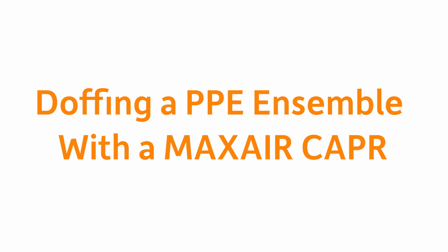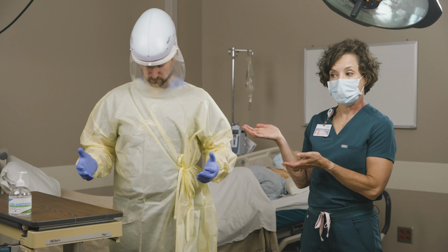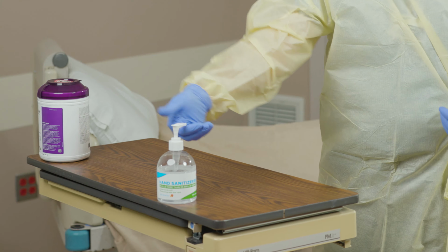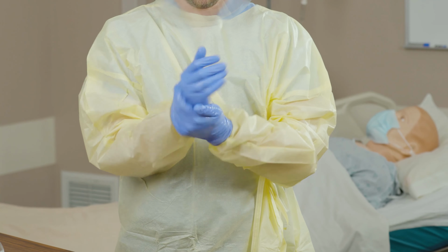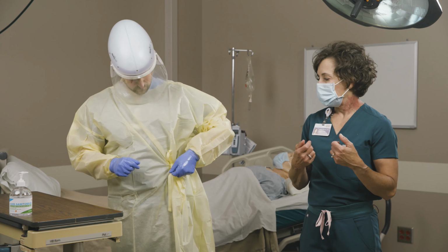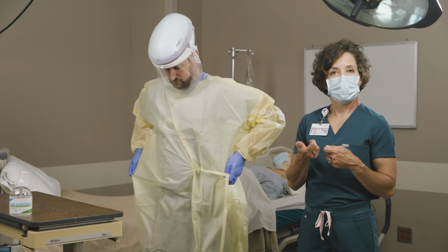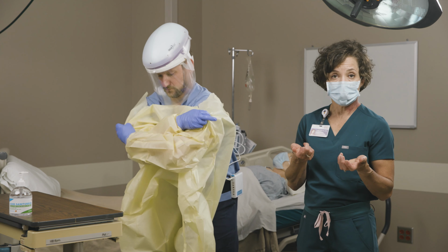All right, now we're going to go through the doffing process. So Stephen is in the patient room right now. He's going to begin by performing hand hygiene. And then he's going to doff his gown and his external gloves in one motion. You can also doff your external gloves first and then the gown, whichever part is more comfortable for you.